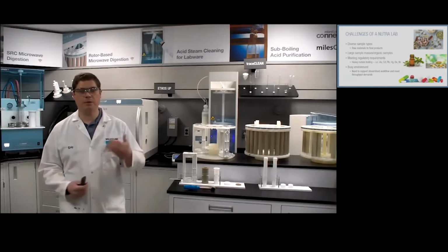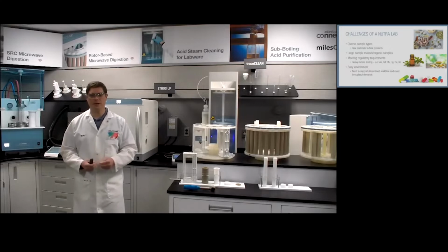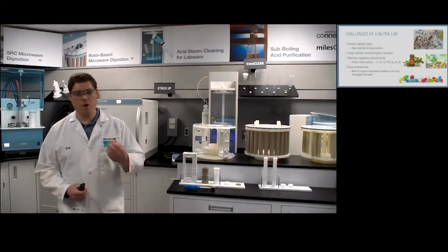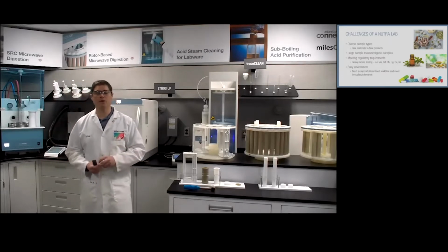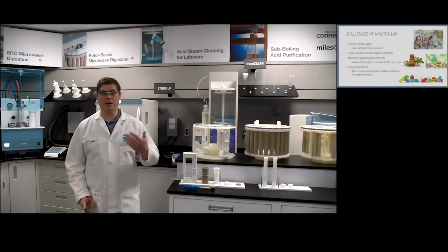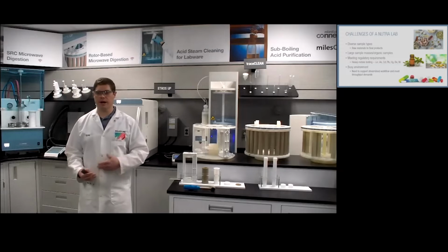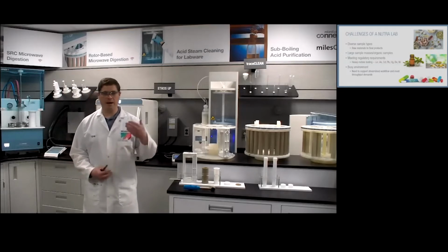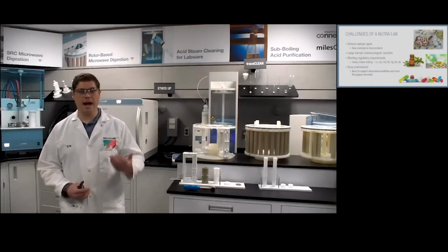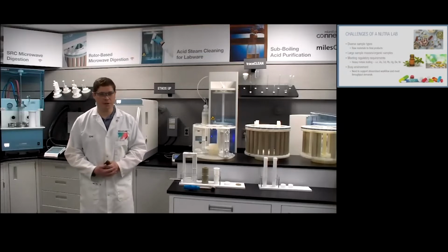Many times you may have to work with a larger sample mass. Larger sample masses are typically required when you need to make sure you're reaching low detection limits in a certain sample, or to make sure that you're working with a homogeneous representation of your sample. Many of the samples that you may encounter may also have a rather high organic content, especially your oils or anything that's higher in protein. And any samples that are of this nature are typically quite reactive. Some of them may produce exothermic reactions and also generate a lot of pressure.